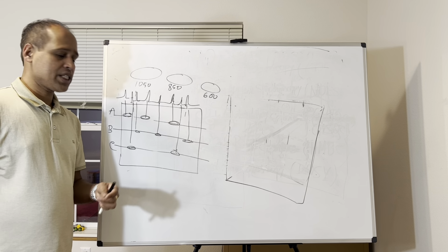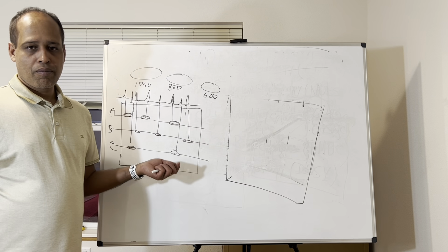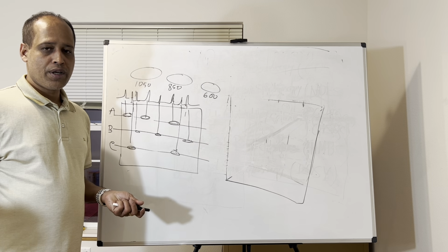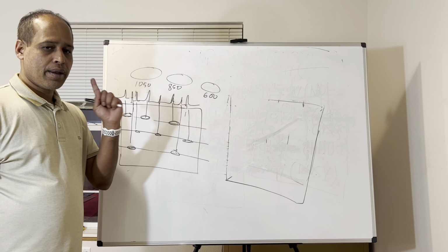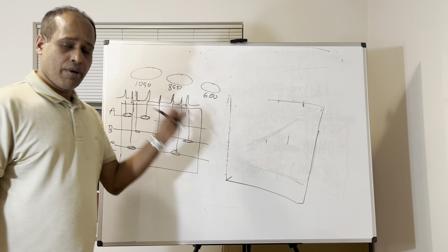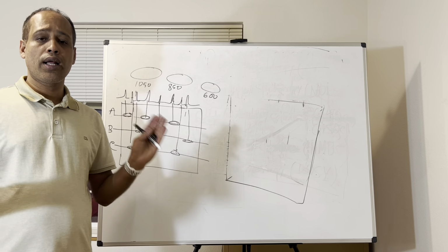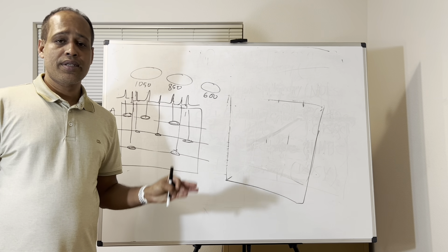I need to recheck. So I'll tell you, or you can ask me in this video, or also in my DOSY video, so you can get the answer. Definitely I explained there, I remember. So hopefully the theoretical background or discussion will help you a lot to understand the COSY, NOESY, HMBC, HSQC.